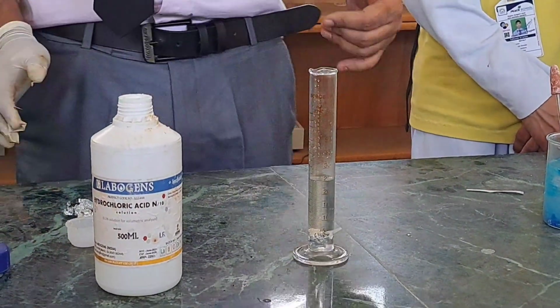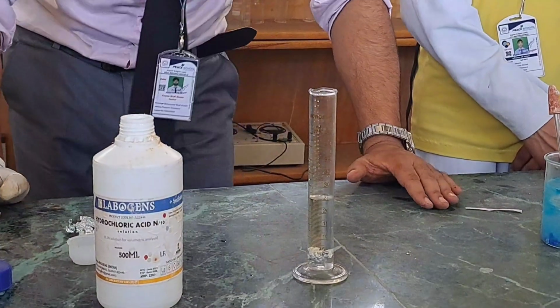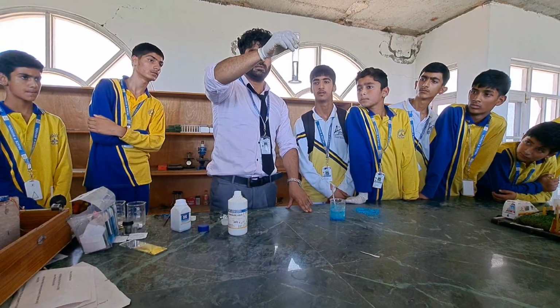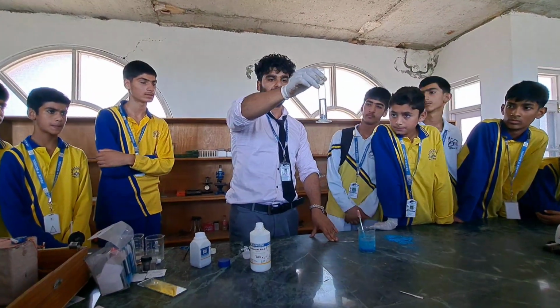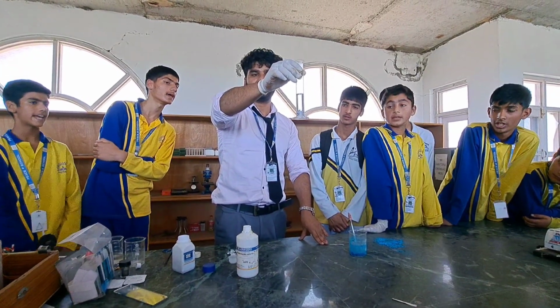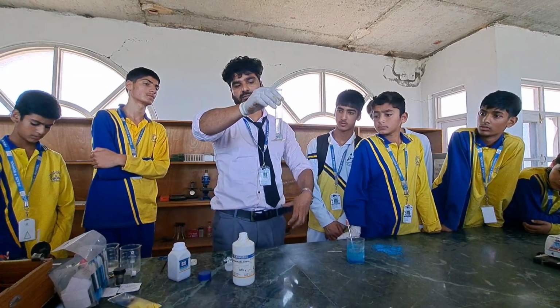You have to wait. You can see some bubbles are coming about. Do you see the bubbles? Yes, sir. These bubbles are nothing else. These are the molecules of the hydrogen gas. And I will keep this mixture, this reaction.